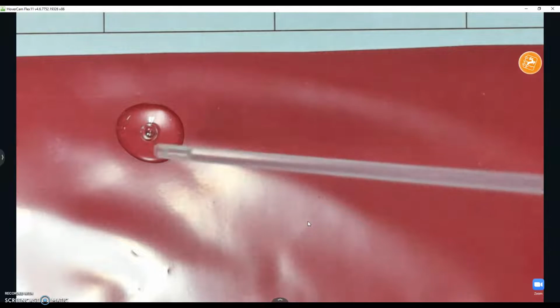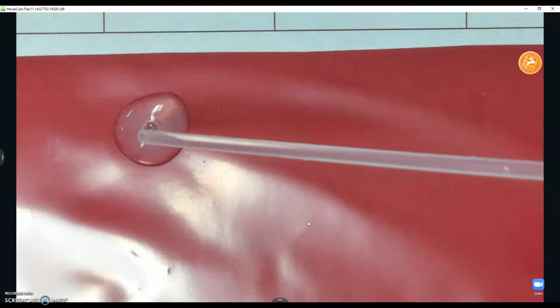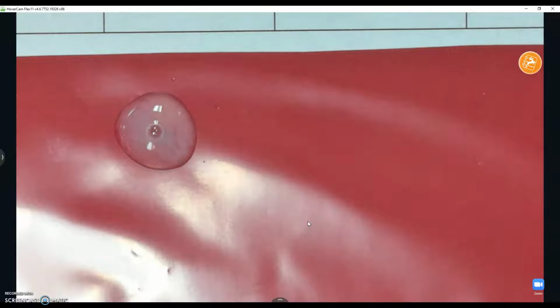Again, this is magnesium nitrate reacting with sodium carbonate. Yeah, we can see a little bit of cloudiness, so you can see it there. So hopefully that'll help you. We can definitely see that's a precipitate. It kind of looks like an eyeball with that thing in the middle. So hopefully that helps you out on that one.